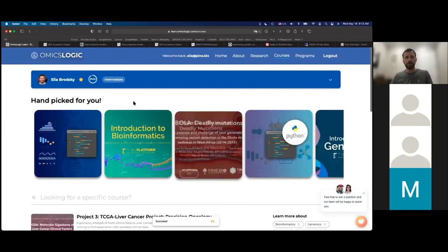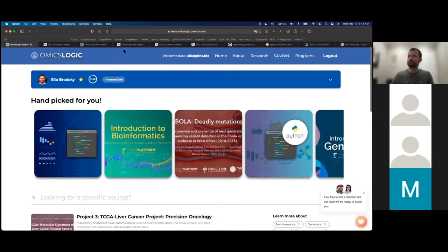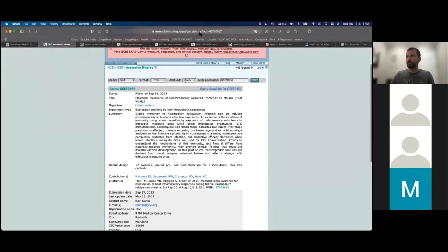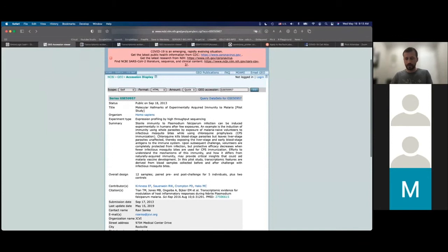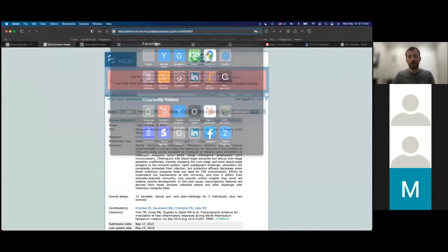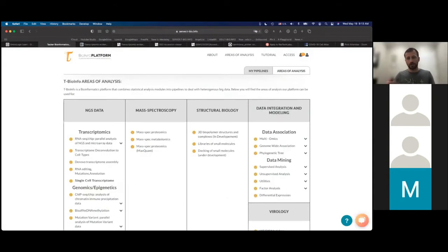All right, so let's go back to RNA-seq. One example that I want to show you is from a real data set that we will be analyzing using the big data analysis platform, so that you can appreciate the logic of RNA-seq analysis. So how is the data mapped, and how is it then analyzed for variation using comparisons between different conditions?